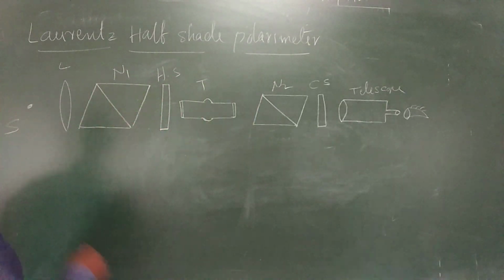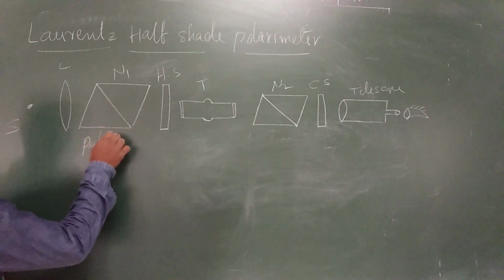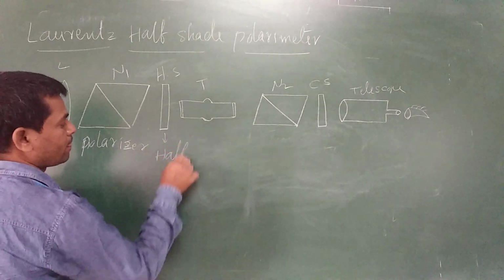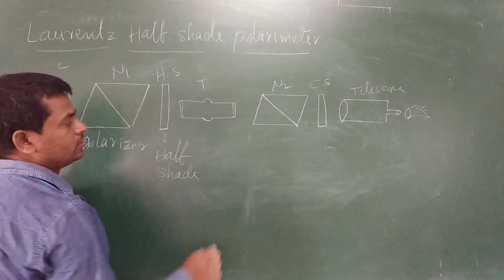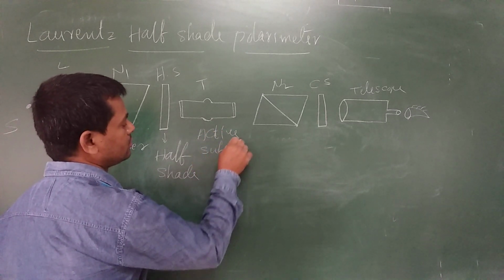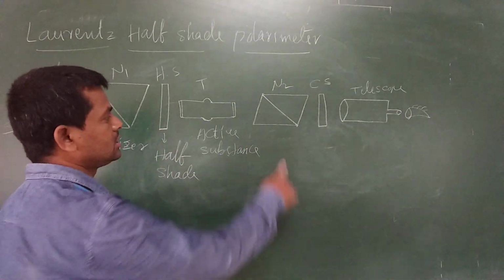Okay. See: source, lens, polarizer, half shade, tube or active substance. Its name is active substance.